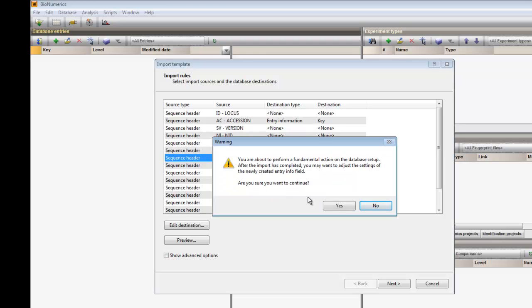A warning pops up saying that I am about to perform a fundamental action on the database setup. This action will be the creation of a new database information field. Please note that you need administrator privileges to do so. I confirm.